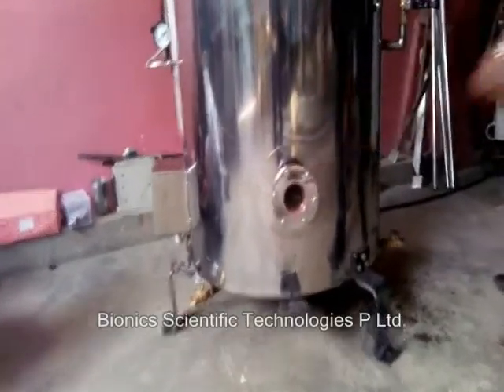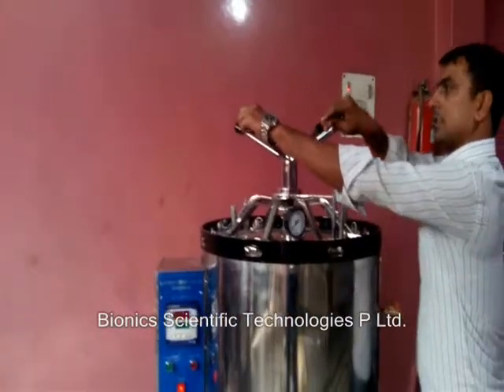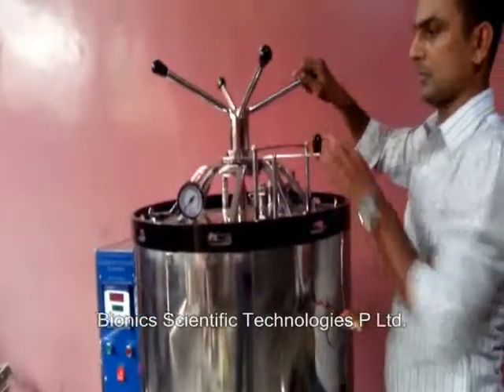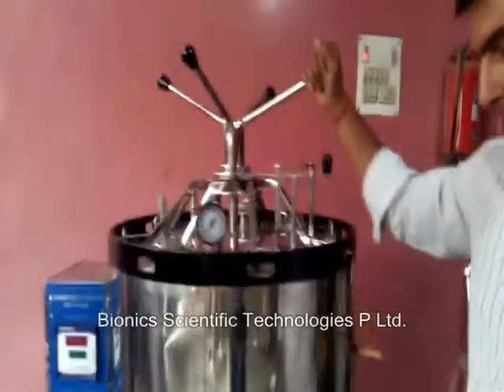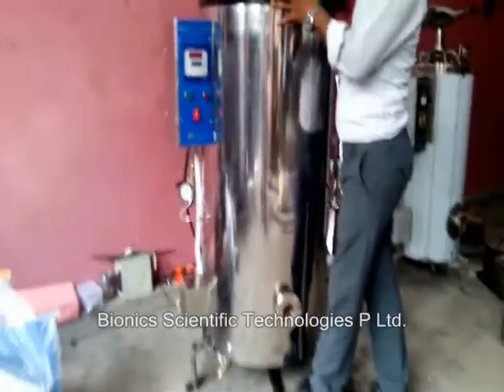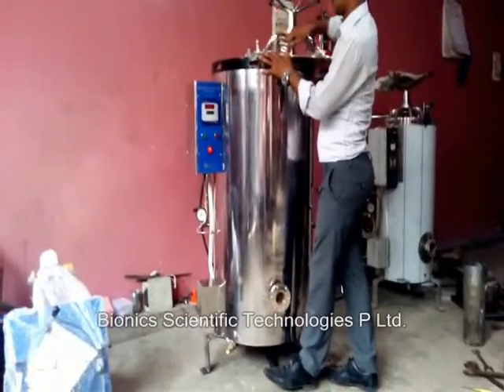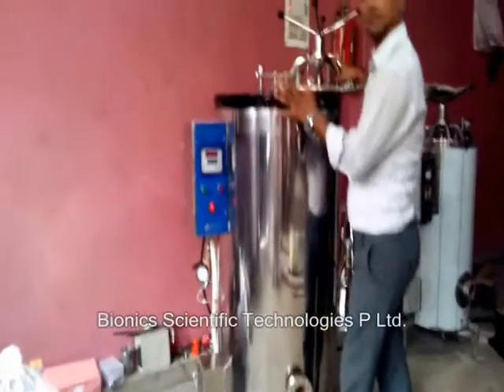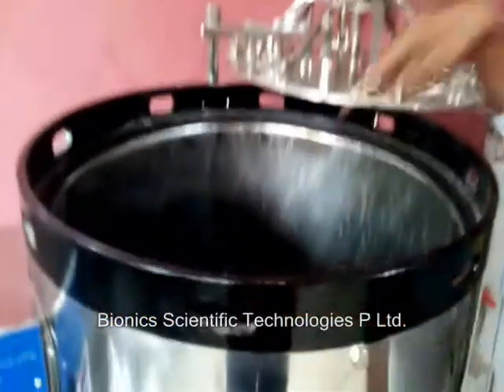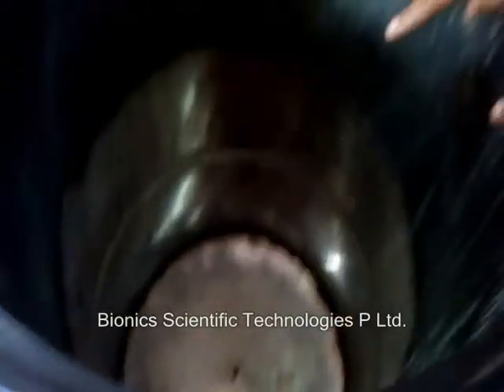Now it is starting. This is our chamber inside SS. Here we have to keep the samples.